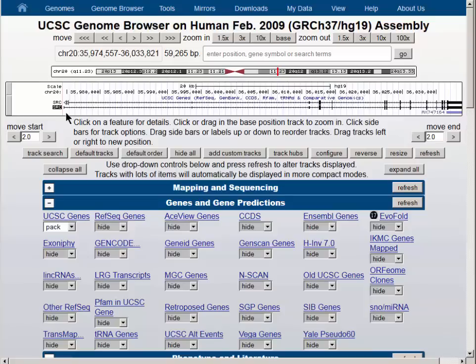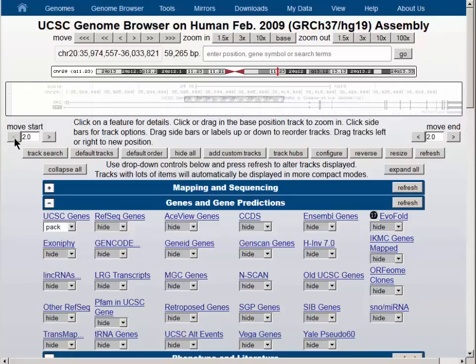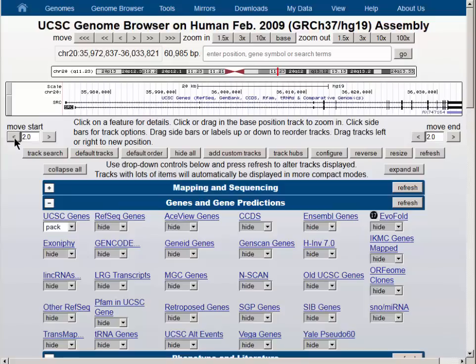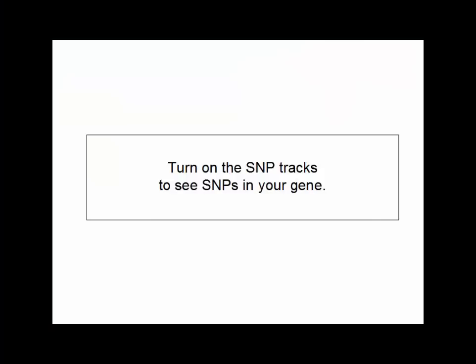If you are interested in getting the SNPs for all parts of the gene, you will want to widen the window just a little bit. We will nudge the window by opening it up using the little left arrow on the side here.